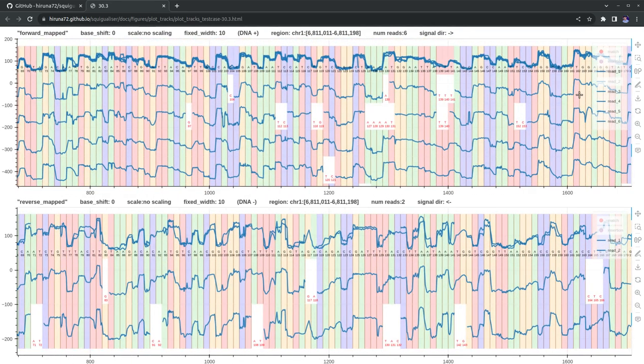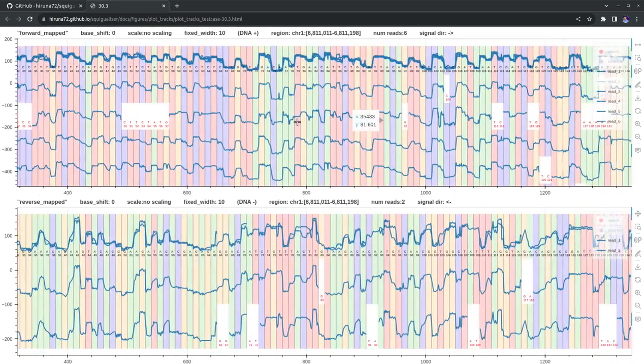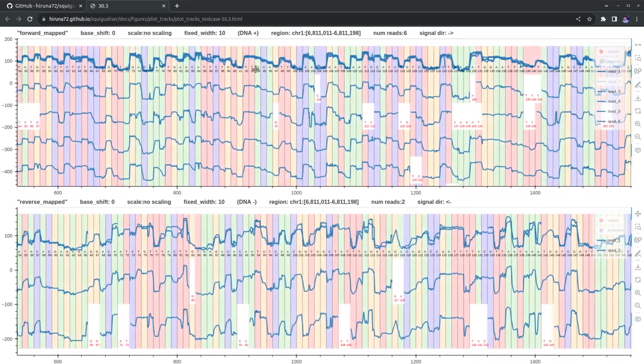Another thing is that if you go to the right side, you can see the toolbox, where if I click and hold on some of these tools, they will have small sub options. For example, if I select the pan in X dimension tool, it will allow me to drag left and right, but my Y movement is limited.